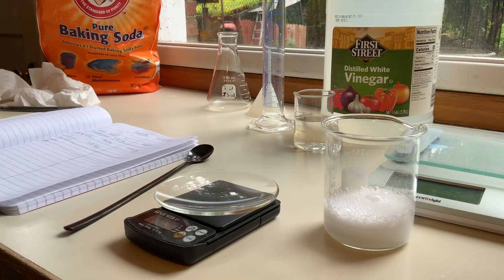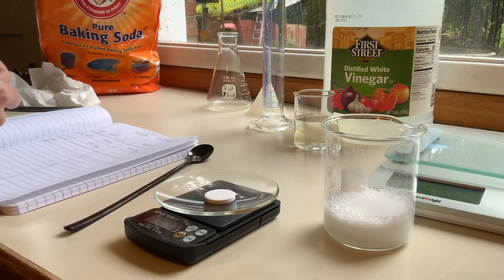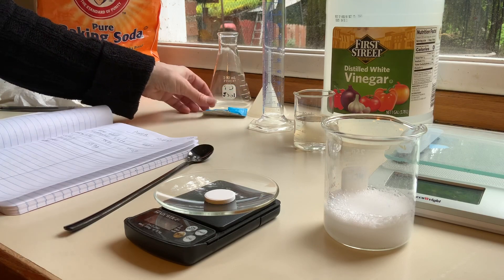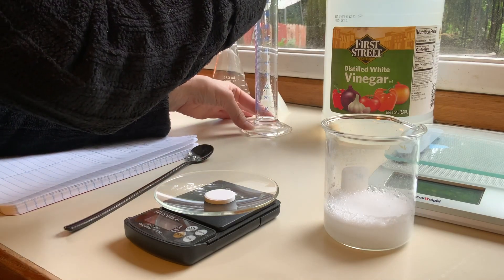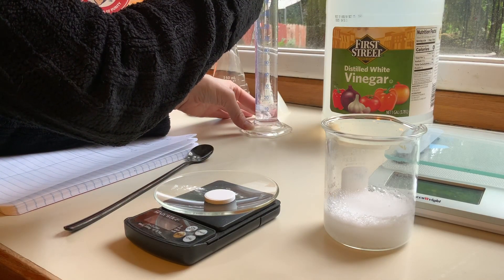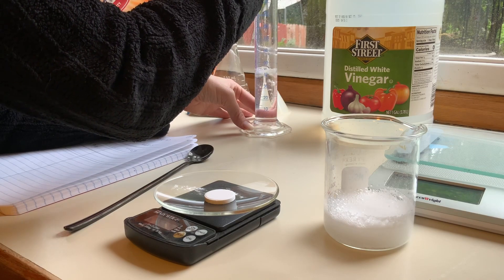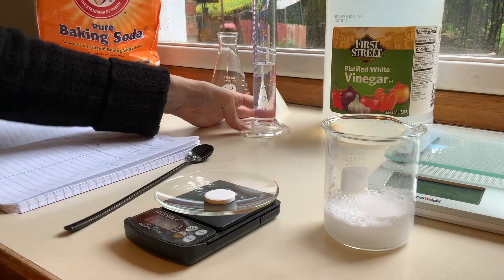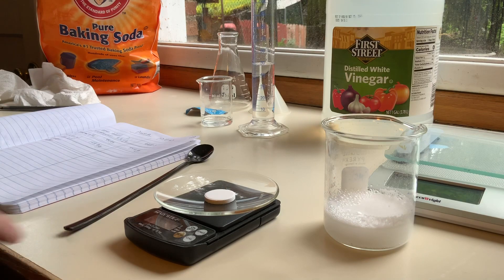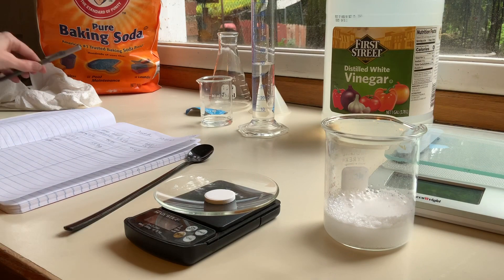I will add tablet number two. I'm starting trial two right now while I wait for trial one to finish up, and that might take a little bit of time. I'll go ahead and measure out my 50 mils of acid. This mass is 58.9 grams for the watch glass and tablet number two together.